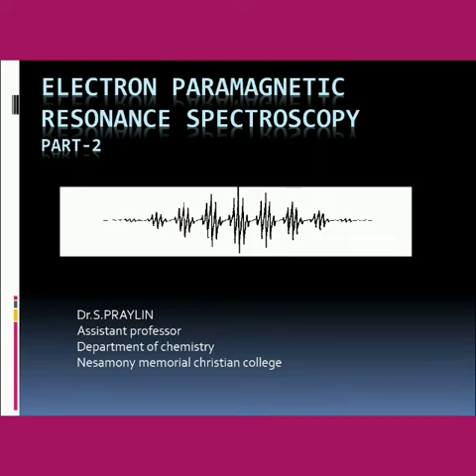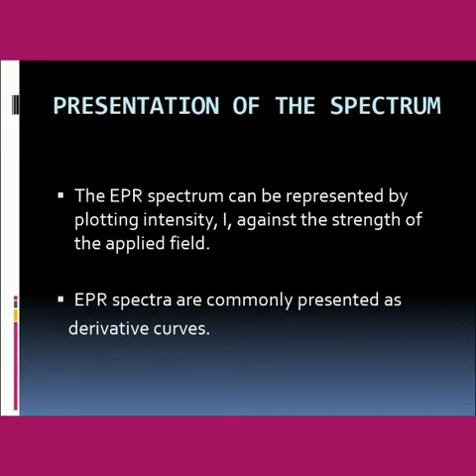Let's learn about electron paramagnetic resonance spectroscopy, part 2. First, let's learn about presentation of the spectrum.